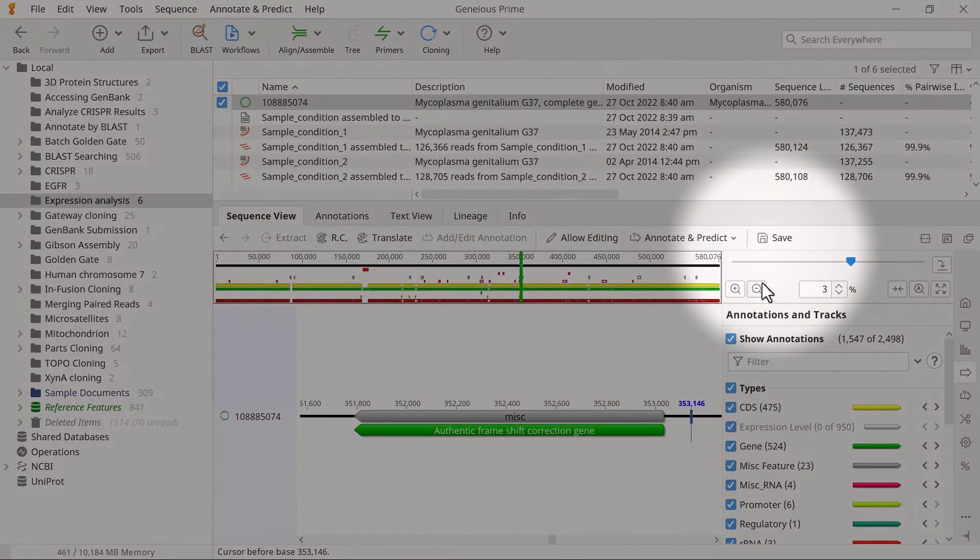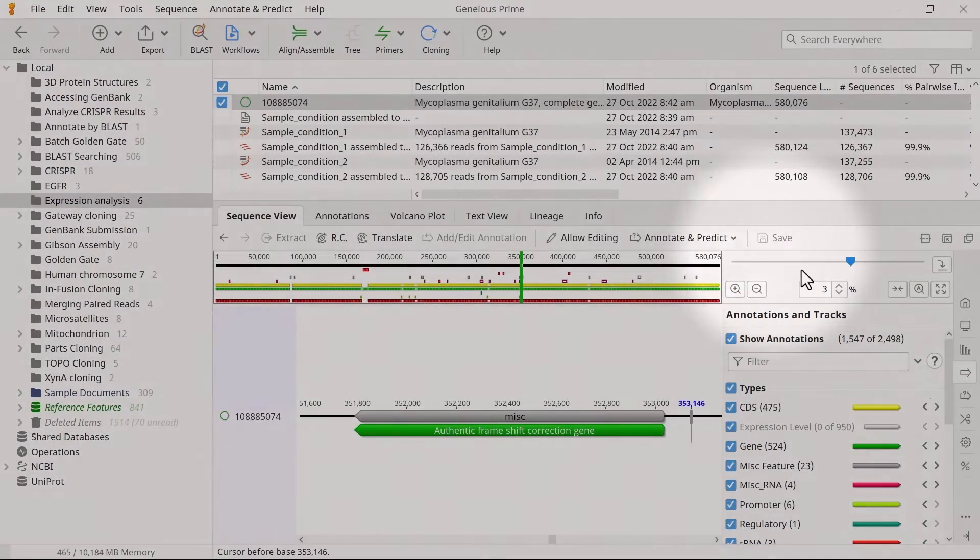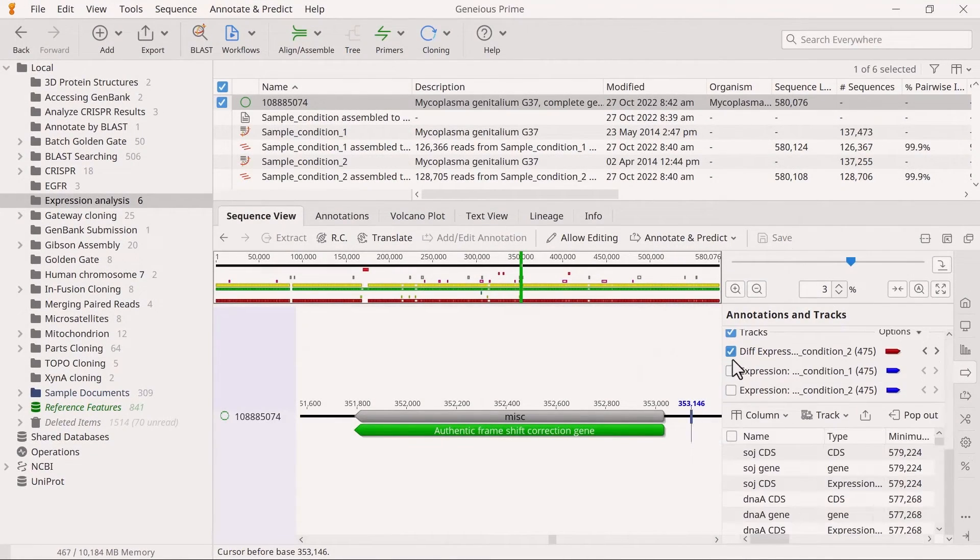Ensure you save the file. Genius will add a new track to the reference sequence.